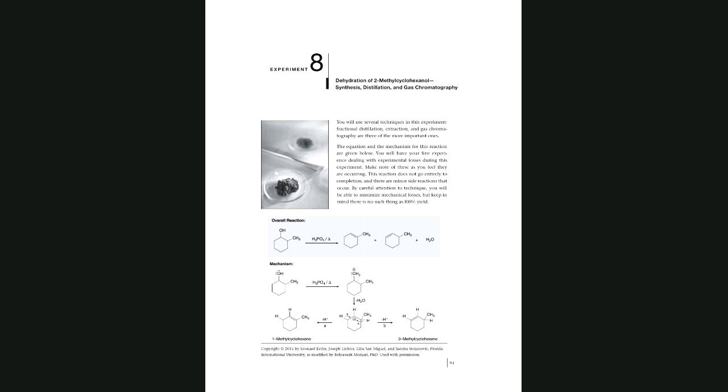To bring the lab manual, and I take you to the bench for the actual experiment. So you need to know the theory because the questions on the test are coming also from the theory, at the same time that you are responsible for techniques and assembly.